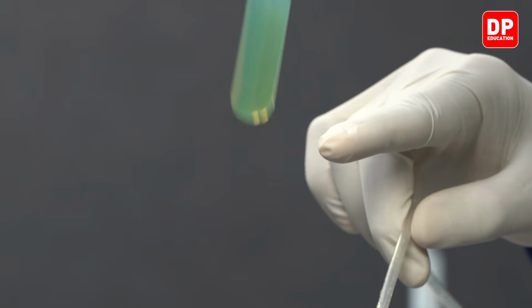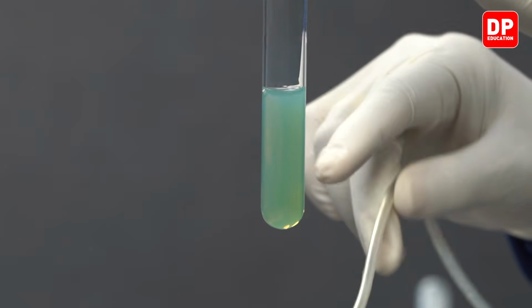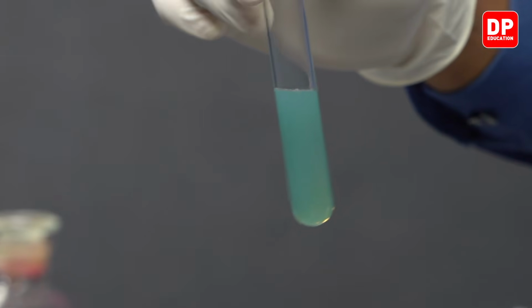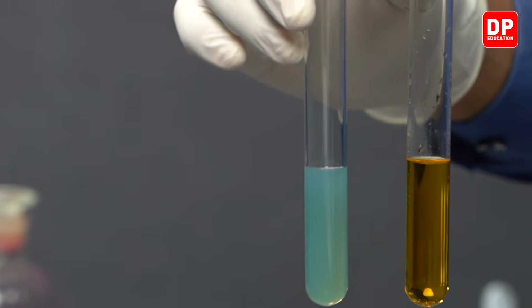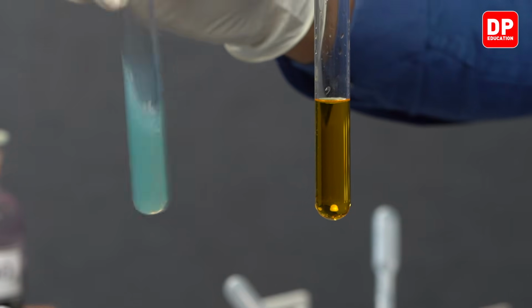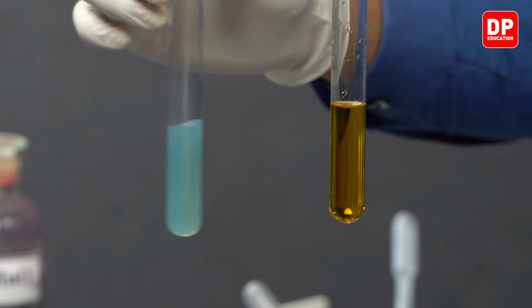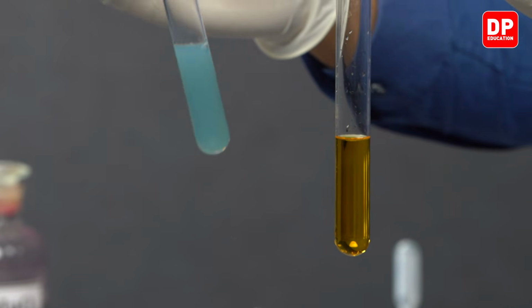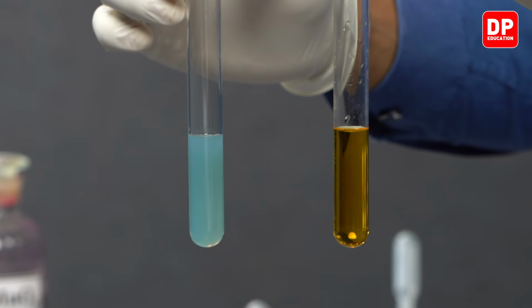This is because as potassium dichromate turned into chromium 3 plus aqueous ion solution, sulfur, solid sulfur, was formed in the form of colloidal sulfur, and that is why we have now formed an unclear solution due to the presence of colloidal sulfur.